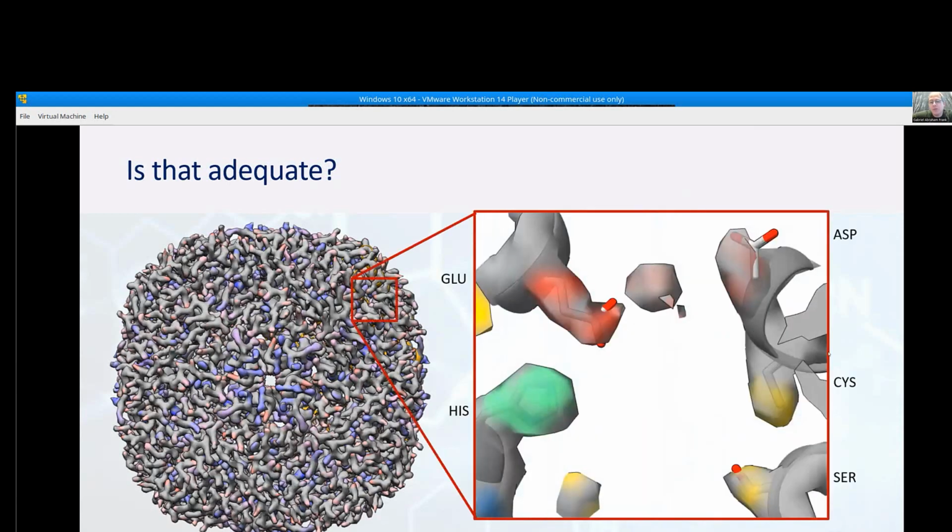Now, what I'm pushing in my lab is to add additional external information on the structure after you get to high resolution. Since we know that there are chemical fingerprints to our data, in principle, we can use them. The chemical fingerprint that I selected for doing that, actually that's the reason that I'm in the US, is to propose that as a standard method. Because we know that different chemical elements of protein structure decay differently under the electron beam, we can also put the decay in as information. And what we are proposing is actually to use the decay information post gaining the structure.